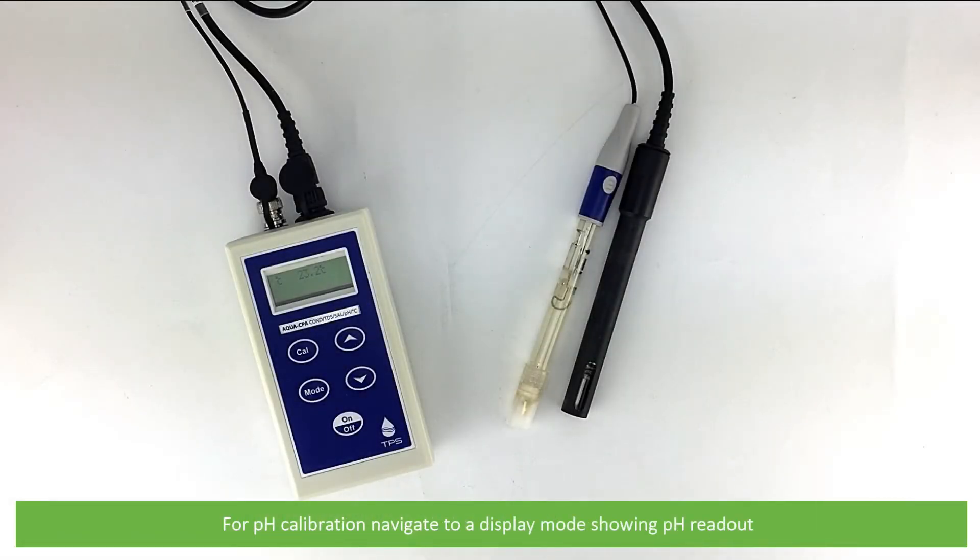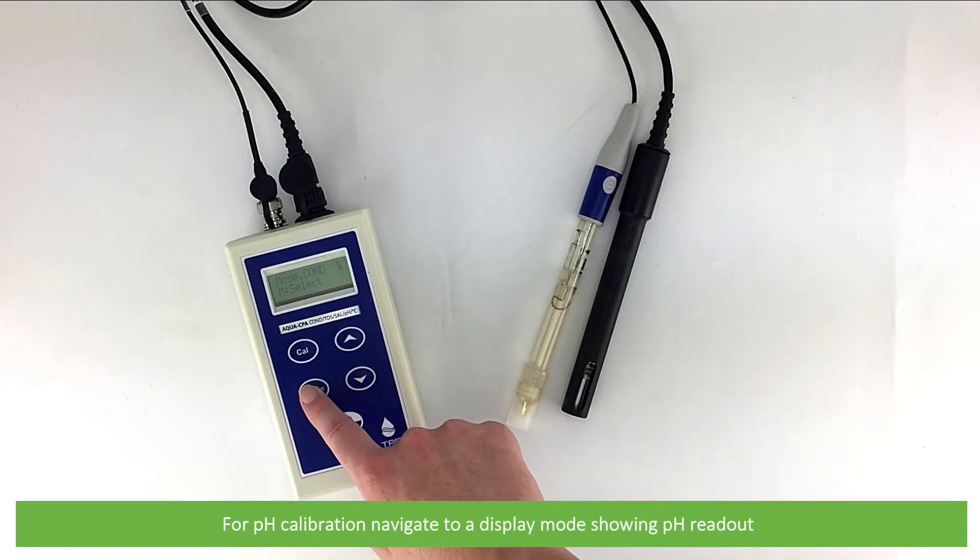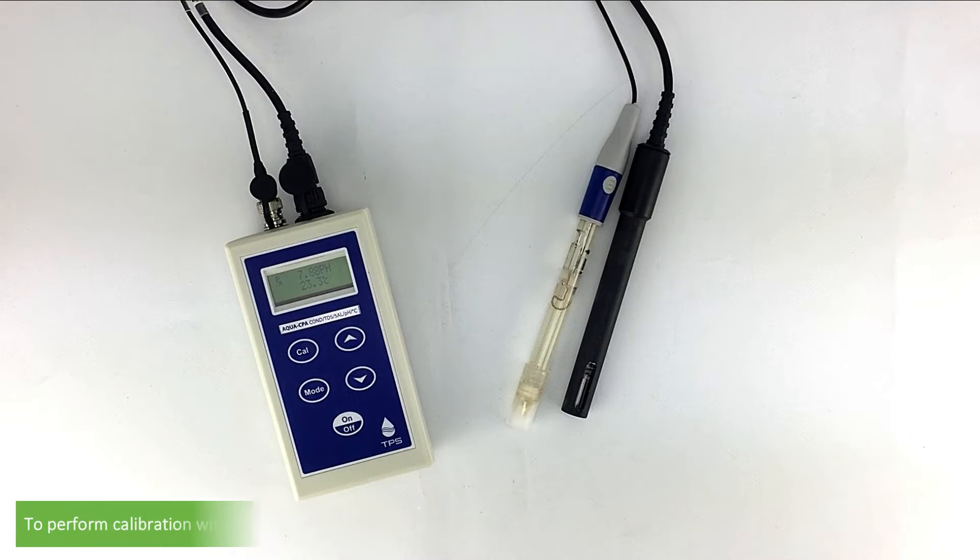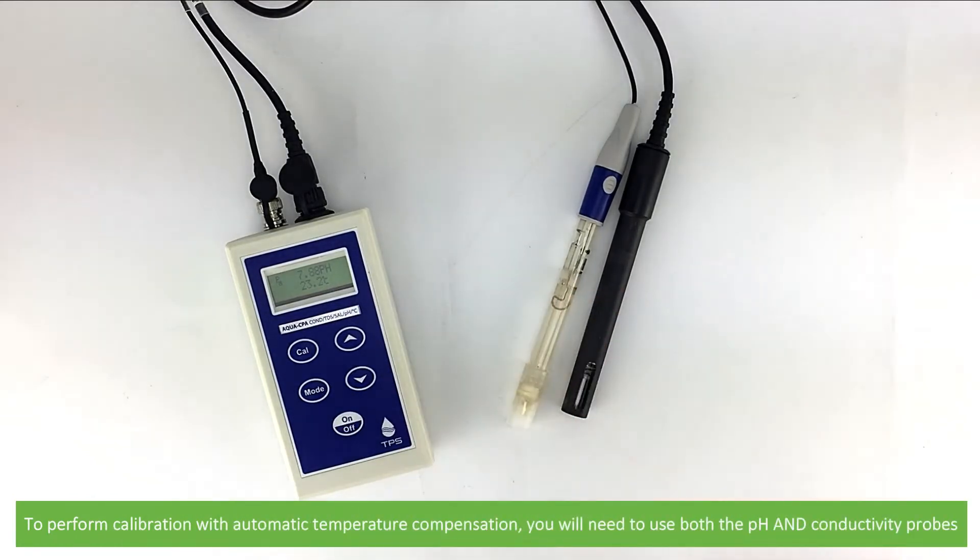For pH calibration, navigate to a display mode showing pH readout. To perform calibration with automatic temperature compensation, you'll need to use both the pH and conductivity probes.